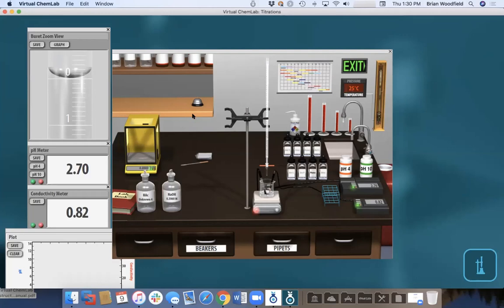It has air built into it. So they can fill it up with water and deliver certain amounts and weigh it using the density, at 25 degrees C. They could then calibrate their pipettes or the burettes. We also include the barometric pressure, so that when you weigh something here, it's the observed mass and not the true mass.